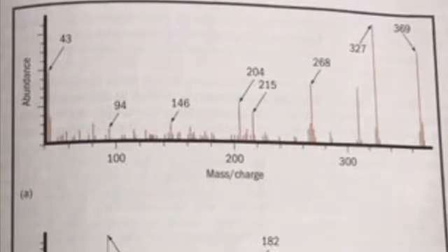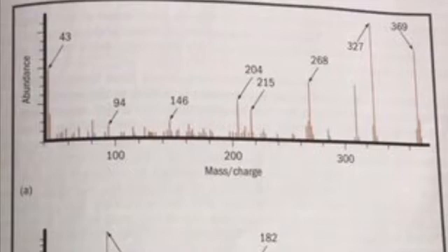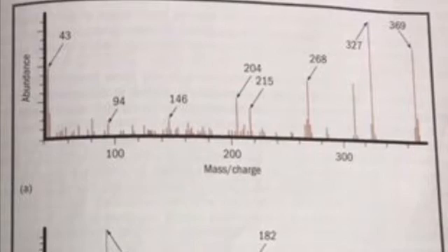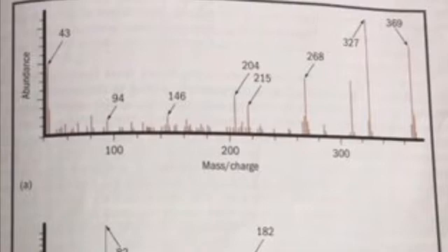So each one of those mass fragments is identified in the mass spectrometer, and you can see there's a large number of fragments as there is in any somewhat complicated molecule. So this is a really, really specific way of identifying compounds. It is used in drug identification. It is used in numerous other applications in which specific identification is required.